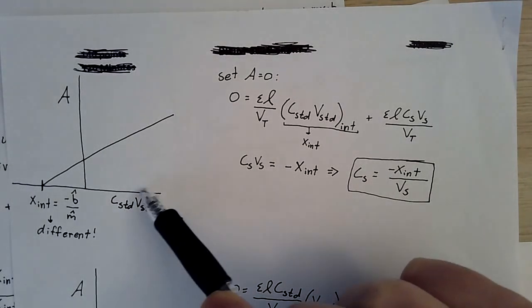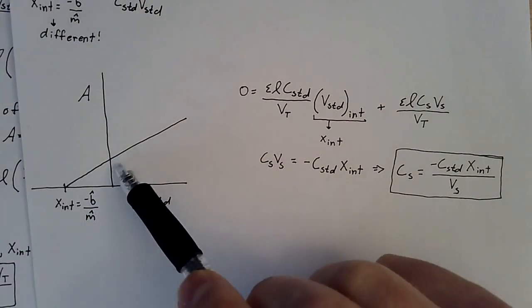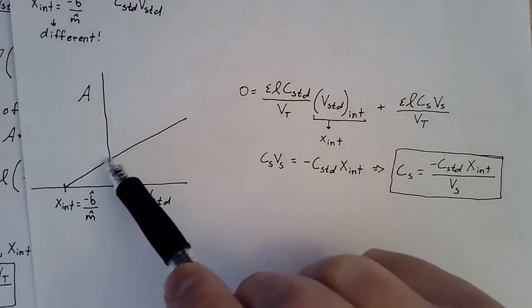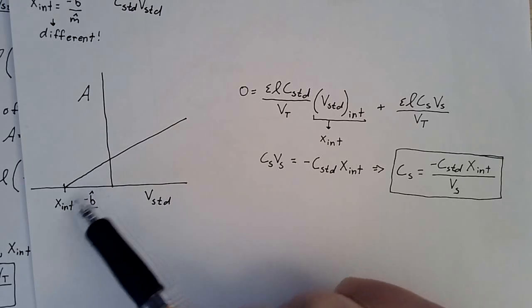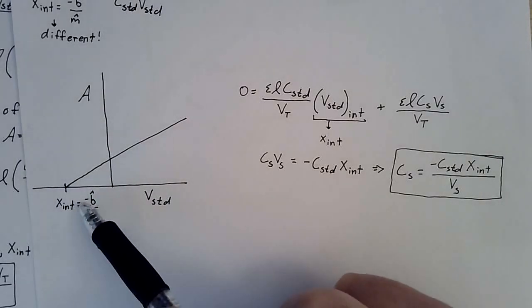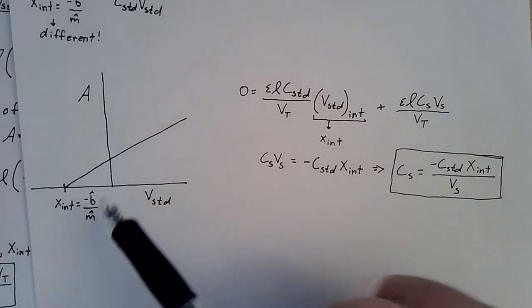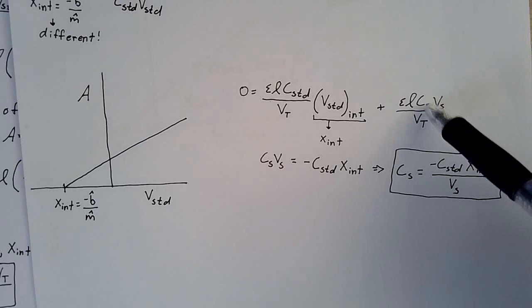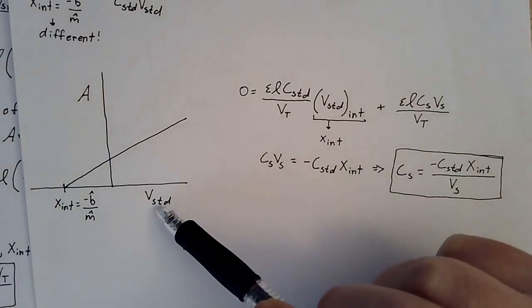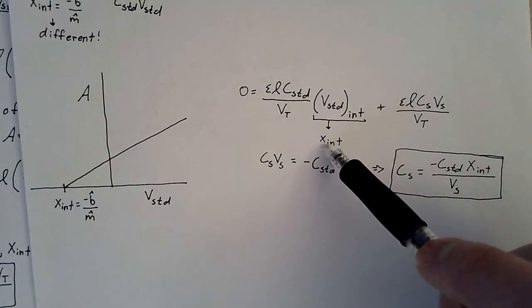Finally, if you plot it against only the volume of standard added, you would have this result. So again, you would have whatever this equation ends up being. It will likely have a different y-intercept and a different slope. But whatever the case, the x-intercept will always be the negative of that y-intercept divided by the slope. So again, we set the absorbance equal to 0 in our Beer's law equation, recognizing that now, since we're plotting it against V standard, that is the quantity that will be the x-intercept.